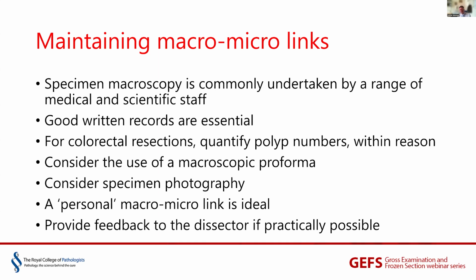So I think it's useful to give some, obviously you don't want to count individual polyps when there might be tens or hundreds of polyps, but to give some idea of how many polyps there are is actually very useful, because it might well be that your written report in the future is all that there exists in the patient record of approximately how many polyps they had, and therefore something which might help to indicate whether they have a particular sort of polyposis syndrome.